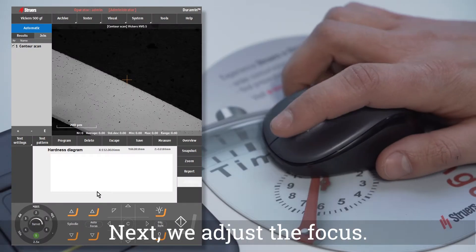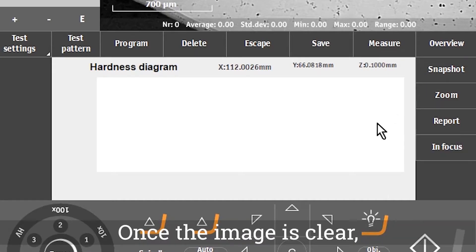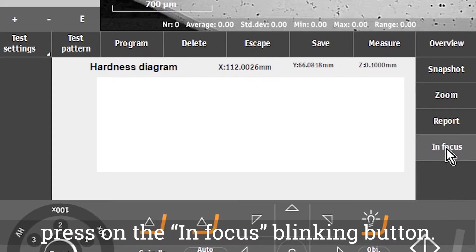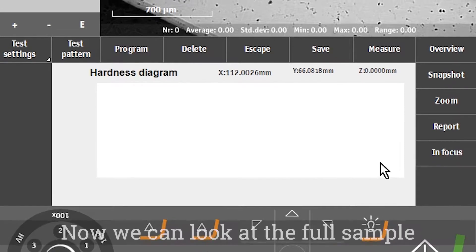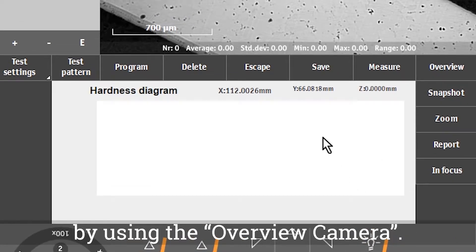Next, we adjust the focus. Once the image is clear, press on the In Focus blinking button. Now we can look at the full sample by using the overview camera.